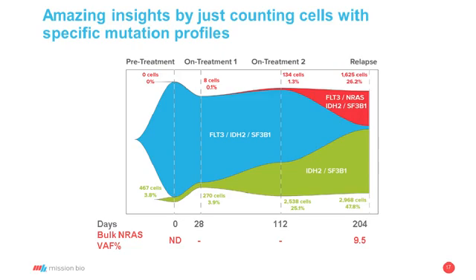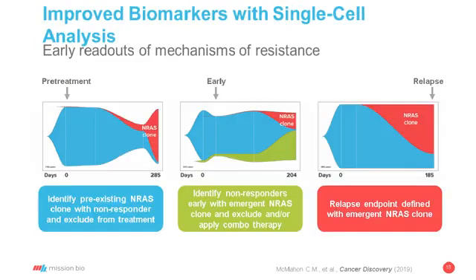This is actually a fairly simple counting problem. We just look at the set of cells that we've pushed through the Tapestry system, identify which mutations occur in each of the cells, and then count the number of cells that have that mutation profile. And then put that over a longitudinal view in this fish plot. But this gives you a really powerful view of what's going on over time, how the subclones are evolving over time due to various treatments or interventions.